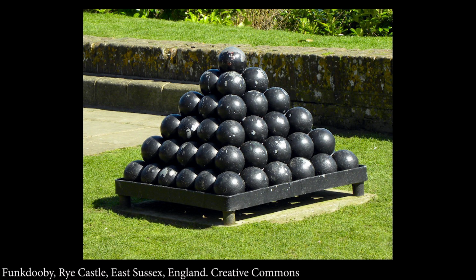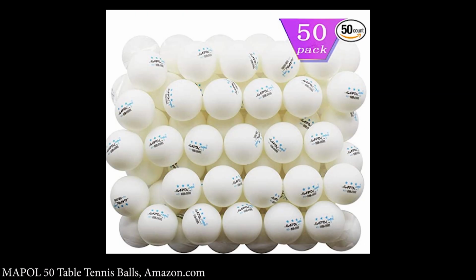So let's think about a piece of dust winding its way through these particles, and let's think about that in comparison to some other particles. We'll go from packed cannonballs to packed ping pong balls. So now imagine a container packed with ping pong balls. So we're going to compare packed cannonballs to packed ping pong balls.